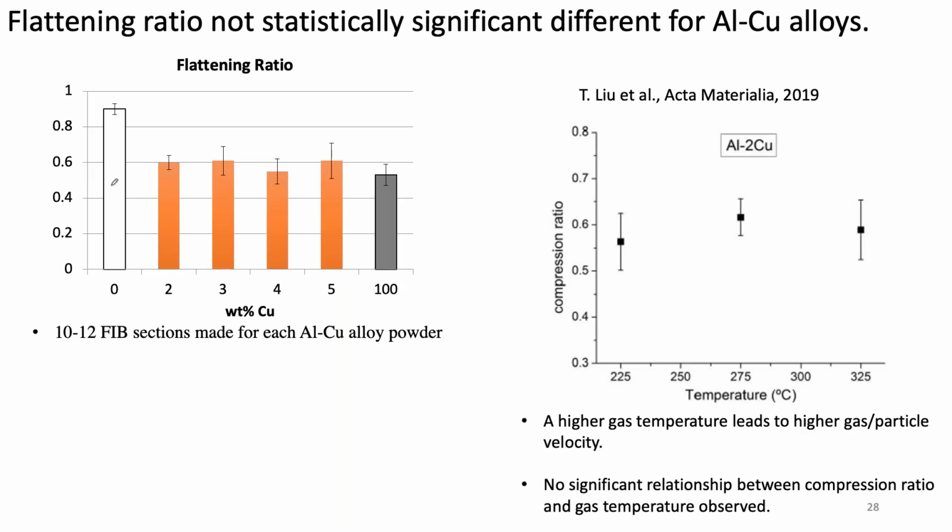We did quantify the flattening ratio for, I think, 10 to 12 focused ion beam sections for each one of these.